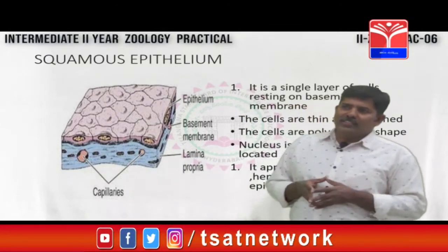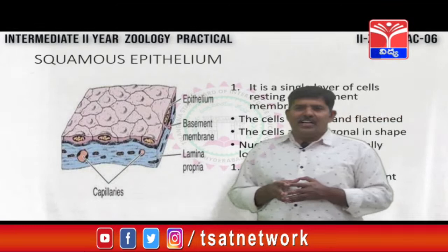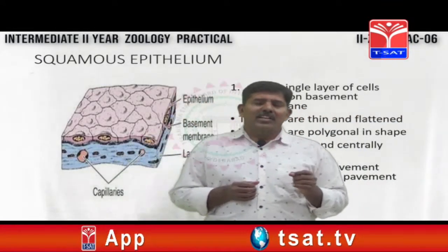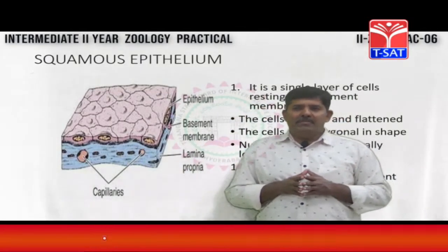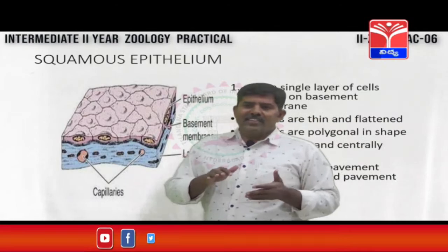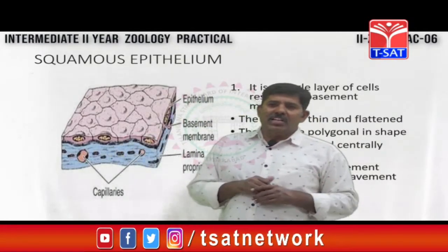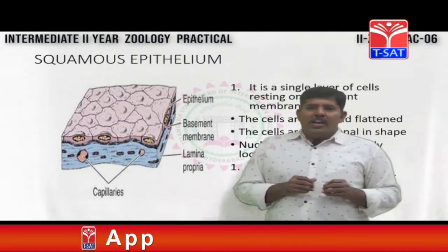So now we discuss squamous epithelium. Squamous epithelium contains a single layer of cells, resting on the basement membrane. These cells are thin and flattened, and polygonal in shape.